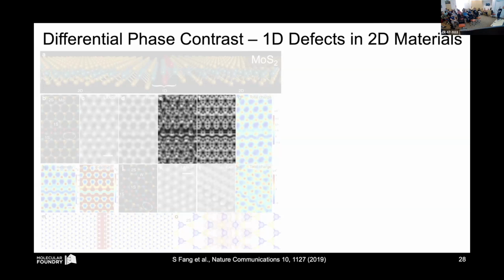Most of the electrostatic potential is the ionic core. This is another big difference between electrons and X-rays, right? We're essentially scattering off of the screened ionic core. So we mostly probe core electrons. Valence electrons are a really tiny perturbation off of those core electrons. And that's why you can see a couple systematic errors there at the interface. But overall, it's not bad.